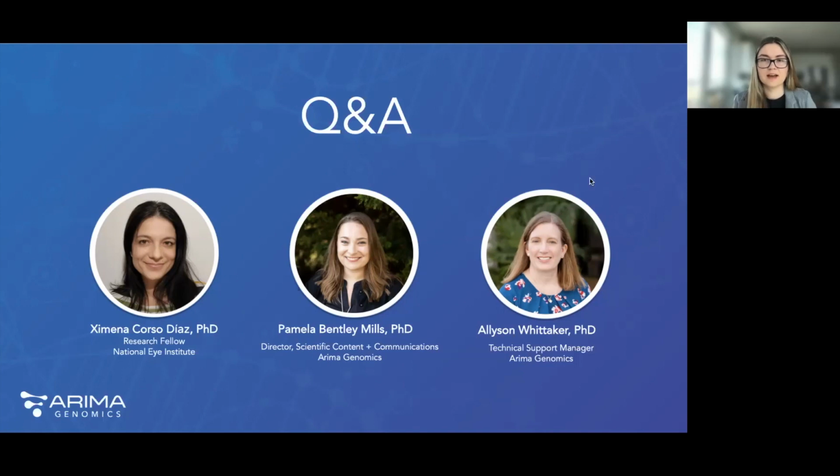Thank you. I would just add there, Janetta, that you can look at chromatin conformation on both a bulk or a single cell level. We have several customers who have developed methods for looking at chromatin conformation at a single cell level, and can point in the direction of papers if you'd like to do that.